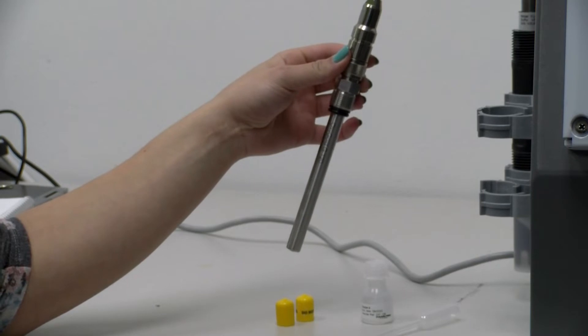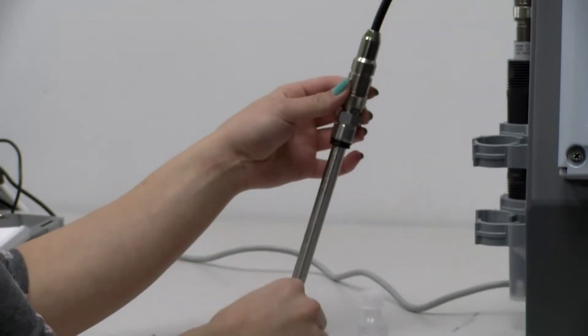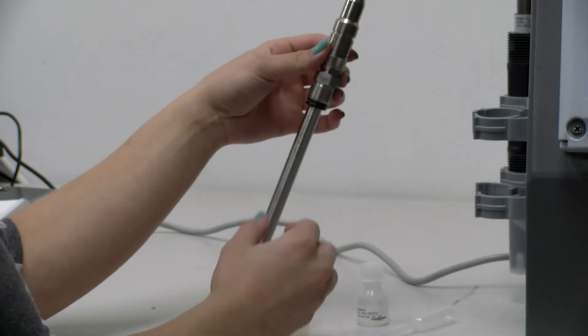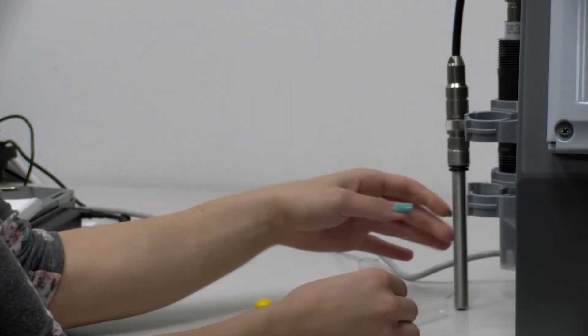Before beginning the initial setup, you need to remove the shipping caps from the sensor. Then you will unscrew the cap and rinse it with an electrolyte solution.